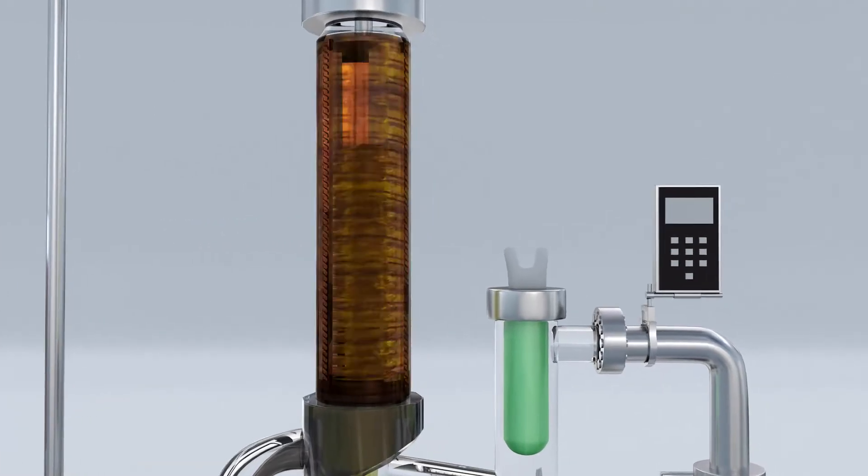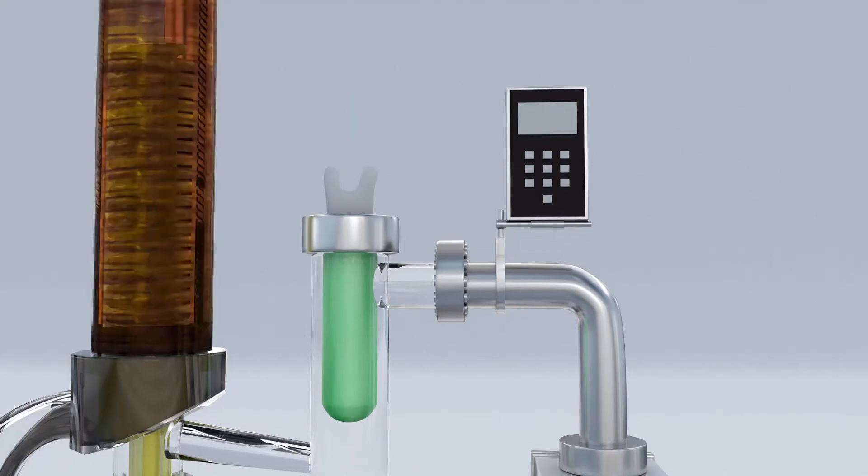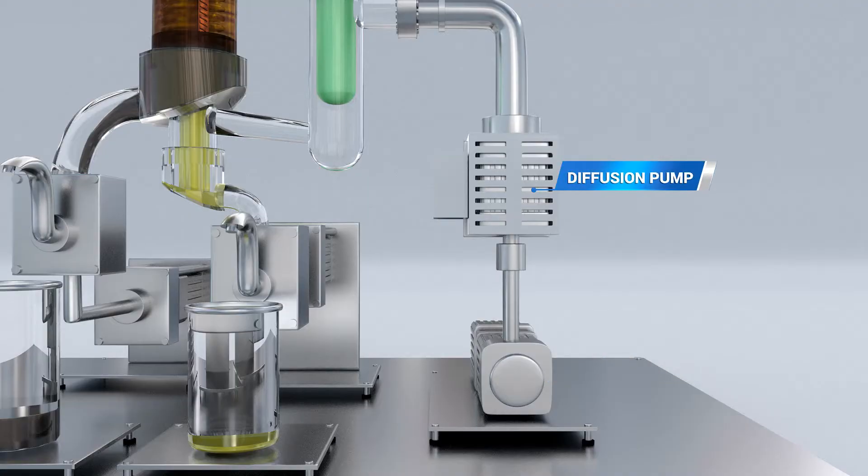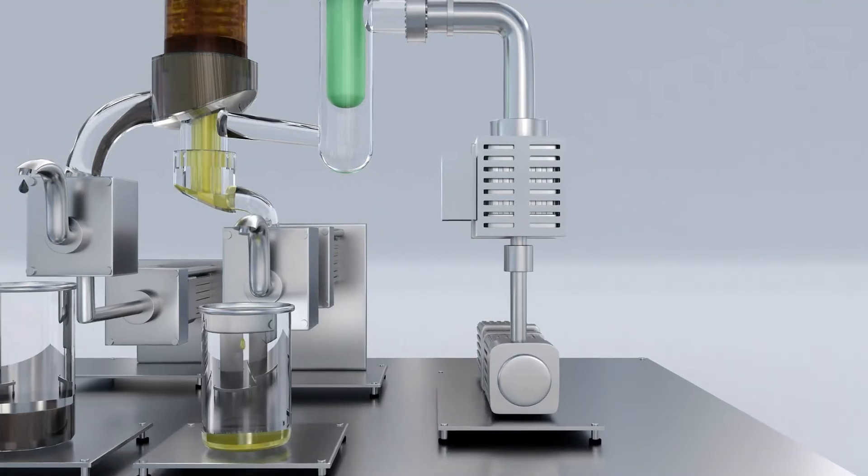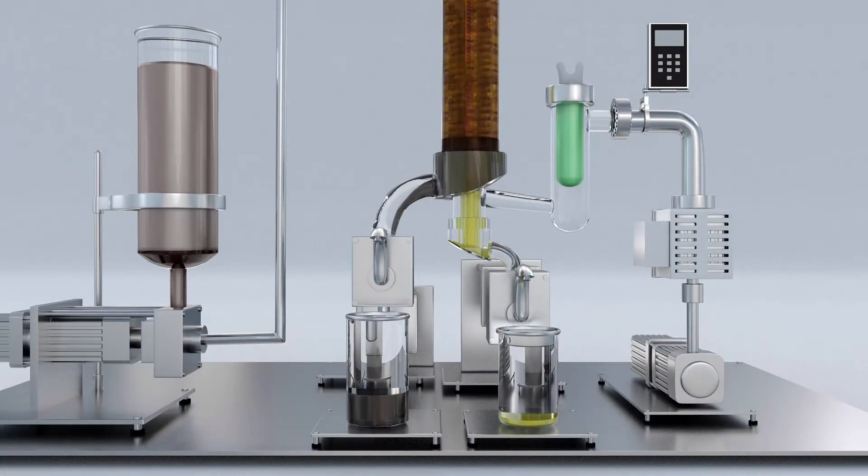The process takes place in a vacuum which is monitored by the vacuum gauge. The vacuum is created by using two pumps, a mechanical roughing pump and a diffusion pump. Reducing the pressure reduces the boiling temperatures of the liquid which, in conjunction with the wiped film, creates greater efficiencies and purity.